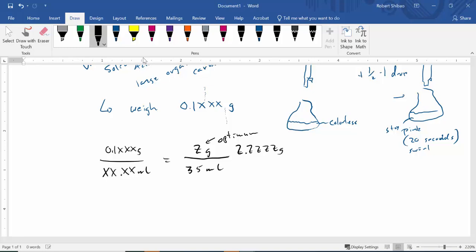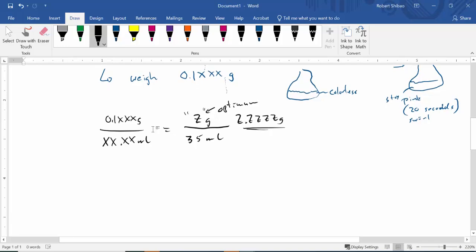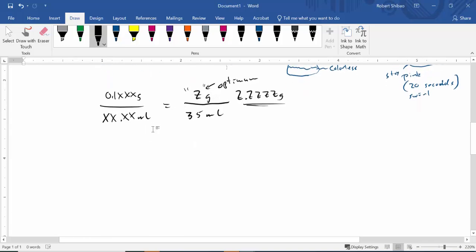Whenever we're doing titrations, it's all quantitative, so we try to get as precise data as possible, so as many sig figs as possible. And so this is right on 35. It should be exactly 35, hopefully. Okay, then we're going to run the titration.